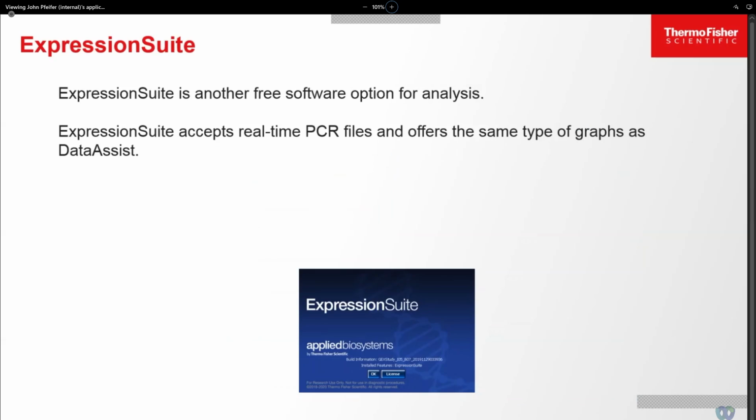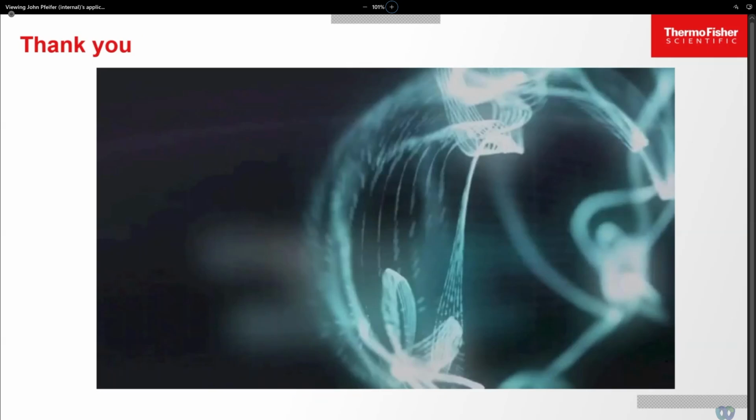We also have free software that does a similar thing called Expression Suite. And in this case, Expression Suite accepts the real-time files rather than the exported results. So that completes the presentation, and I thank everyone for participating in this.